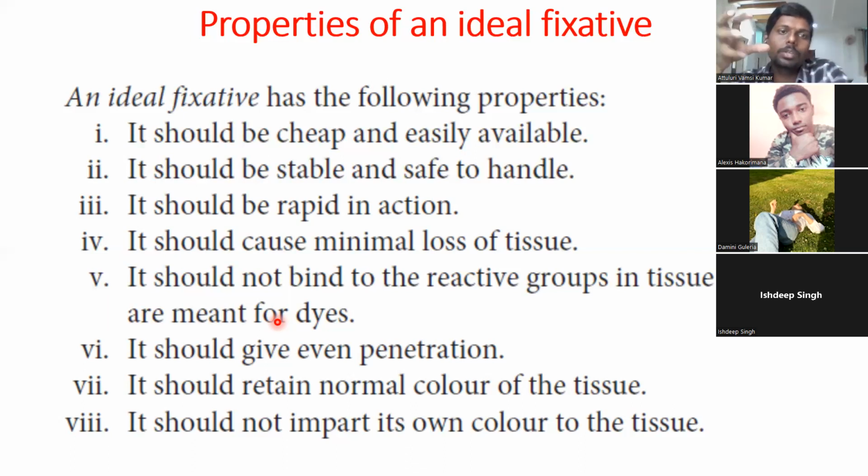Such a type of fixative we need to take, but so far there is no single fixative that is able to fulfill the criteria of an ideal fixative. There is no such thing as an ideal fixative. Each and every fixative has its own pitfalls, its own advantages and disadvantages. That is why choosing the right fixative is an art. We need to choose the right fixative depending upon the criteria that we want. So choosing the right fixative is also an important task before fixing the tissue.